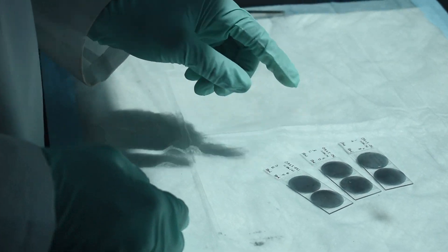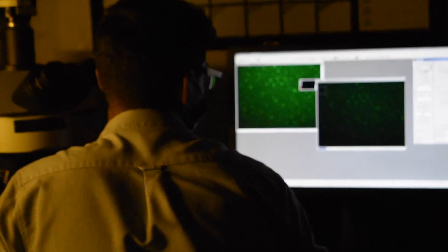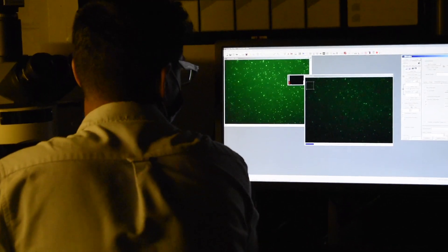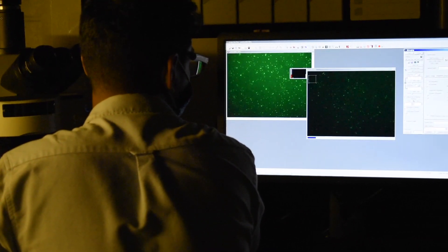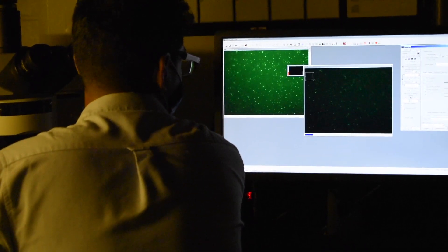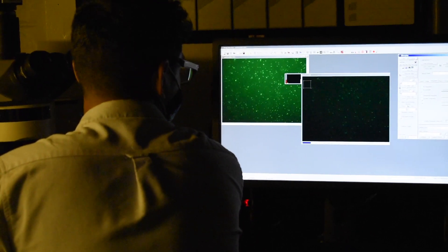And then once on the microscope we do manual counts using a grid in one of the eyepieces and we count how many bacteria there are. We can also do image analysis and get the software to do some counting for us as well.